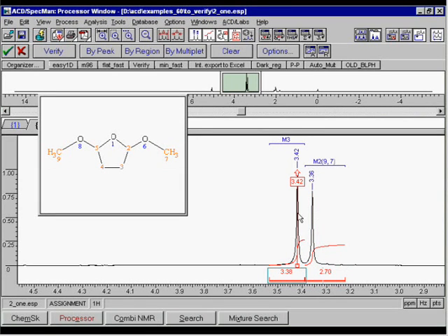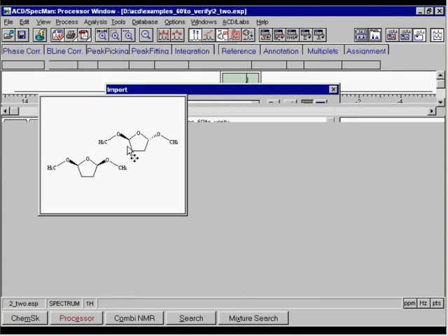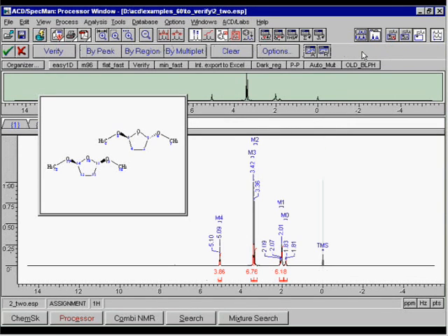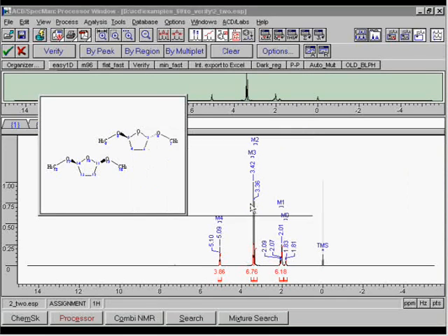This signal is similar to that of a methoxy group possibly coming from an isomeric structure. This hypothesis can be checked on the same spectrum with two isomers shown explicitly. Now, structure purity is close to 100%, and each singlet is assigned to methoxy groups and their respective isomers.